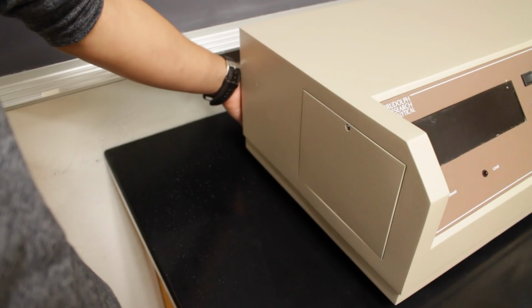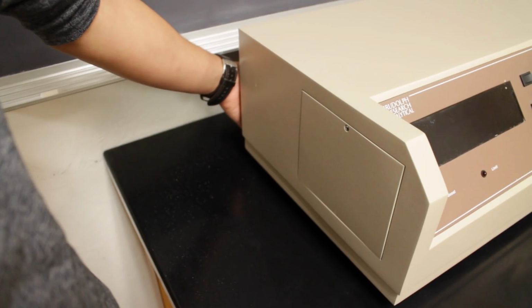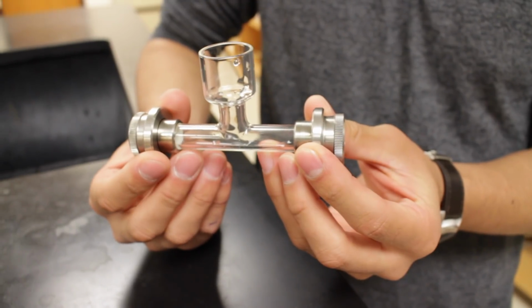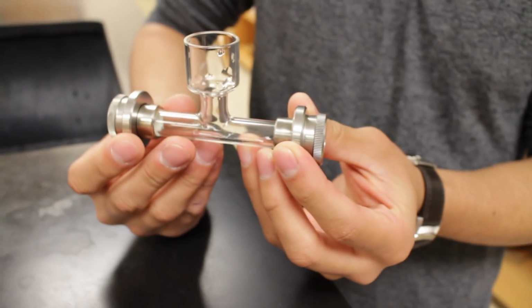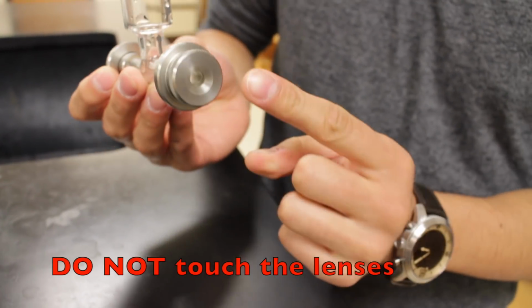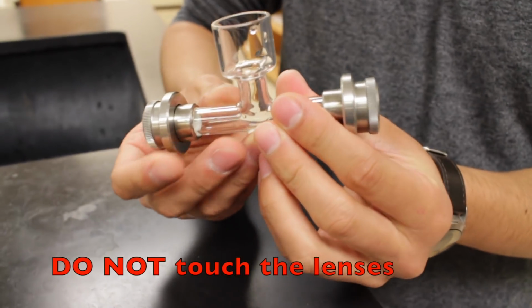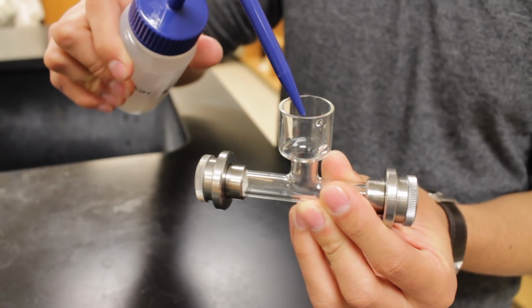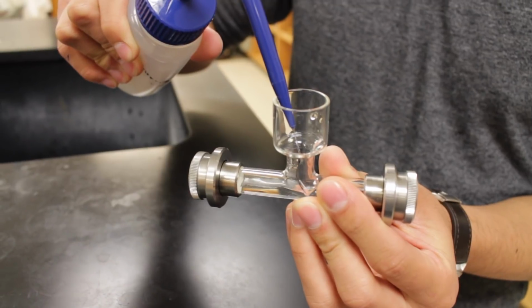Now we are going to show how to use a polarimeter. First, turn on the switch on the back of the polarimeter. This is a polarimeter cell. You need to handle this carefully. You can touch wherever is convenient except the lenses on the sides because this is where the polarized light passes through the solution. Before testing the sugar sample, you need to calibrate the polarimeter with distilled water.